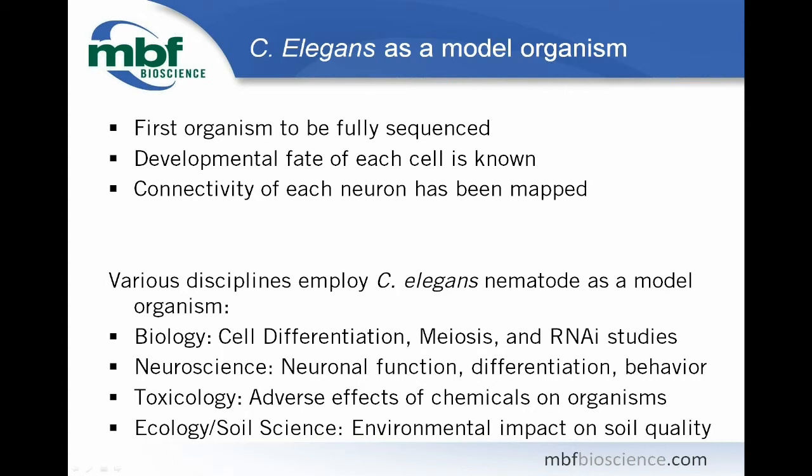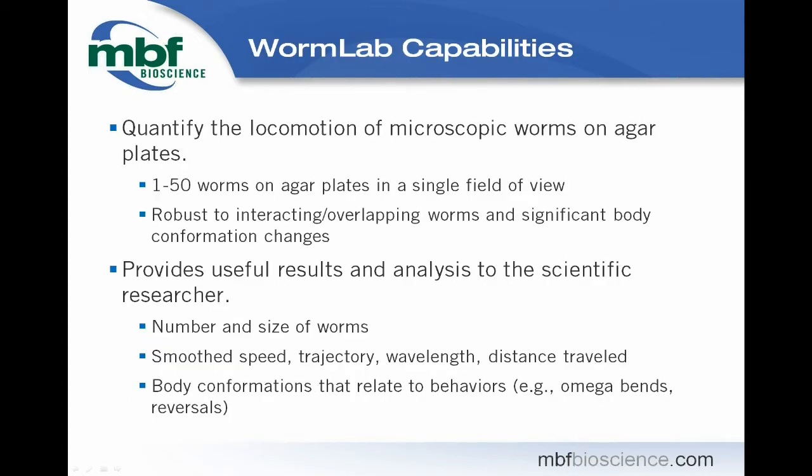Wormlab is a commercial product that allows investigators to perform automated quantitative analysis of locomotory and other complex behavior of freely moving C. elegans nematodes. These assays are used in many areas of research, including those focused on neurodegenerative diseases, aging, and toxicology. Additionally, locomotion is a common screening tool for genetic assays. Wormlab quantifies worms moving on agar plates with or without the presence of a lawn. It has been designed to keep track of worms even after interaction events so that the identity of worms throughout the entire experiment can be known, rather than returning information about the entire population of plated worms.